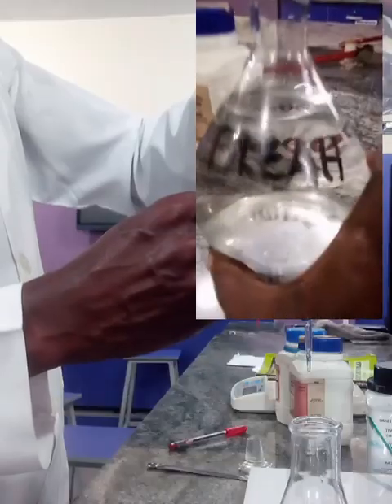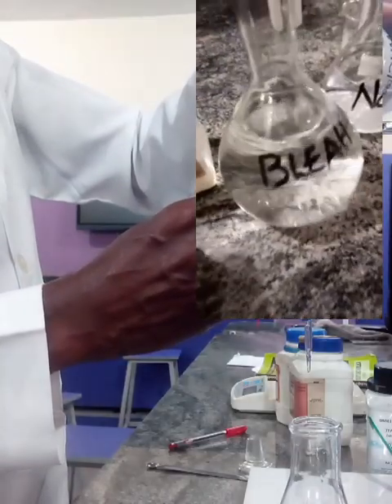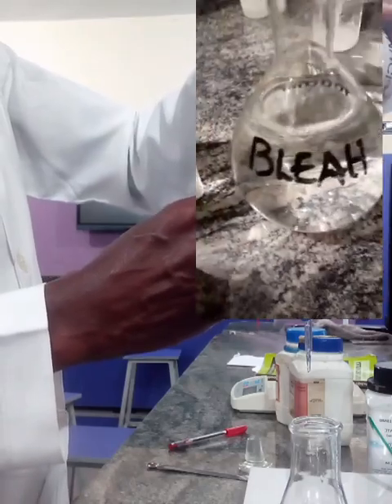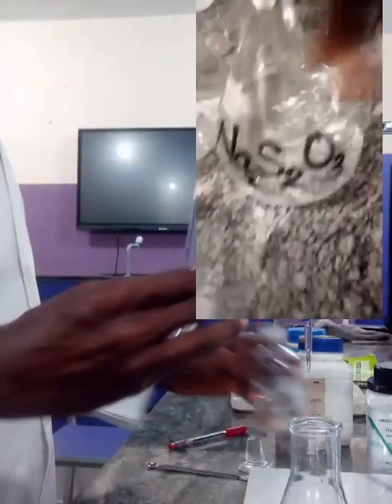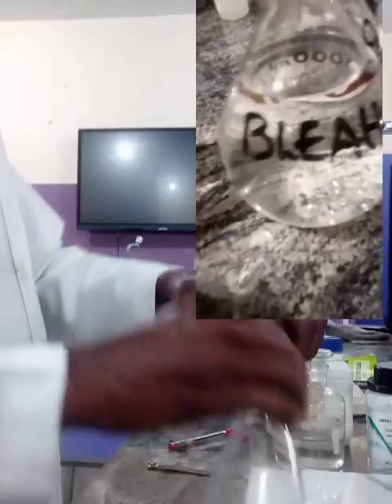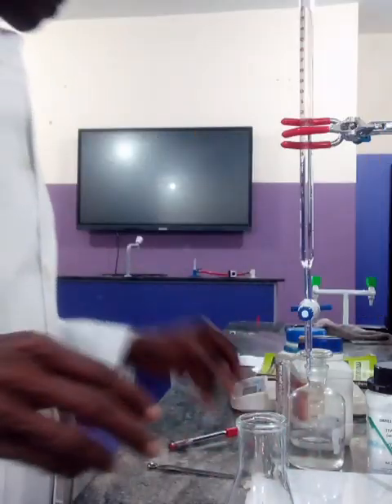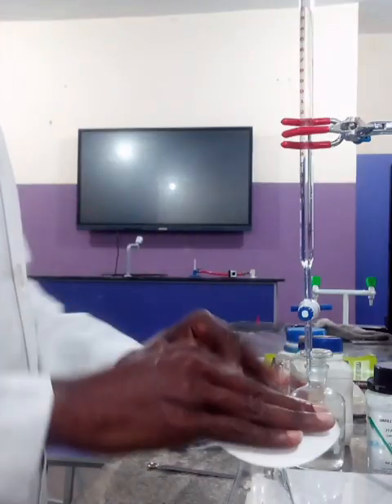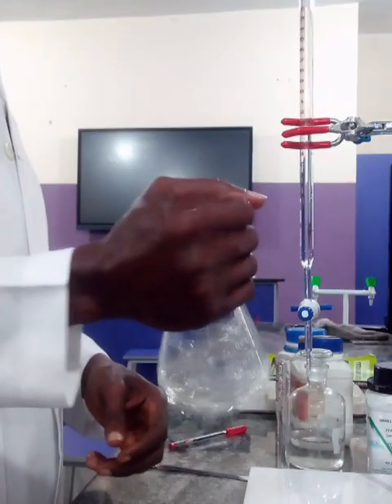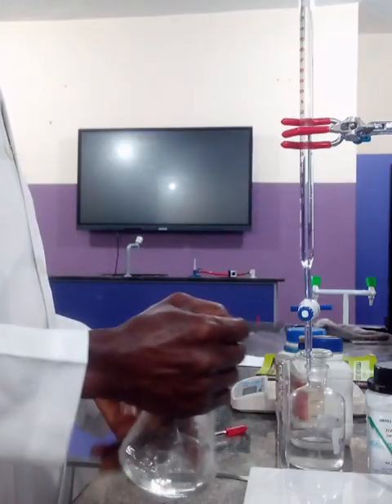After diluting it, you prepare a standard sodium thiosulfate solution, and then carry out the titration. Titrate the thiosulfate solution against a given volume of the bleach solution, and then you get an endpoint.